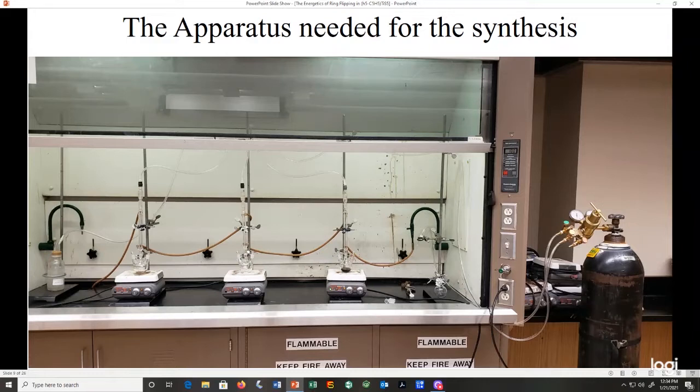Here we've got an overall picture of the apparatus needed for the synthesis. We've got a nitrogen tank here to supply nitrogen. We've got one line going to the gas manifold up here, and we've got another line going to a purge needle here that we're going to be able to use to purge the headspace of our bottle of superhydride.